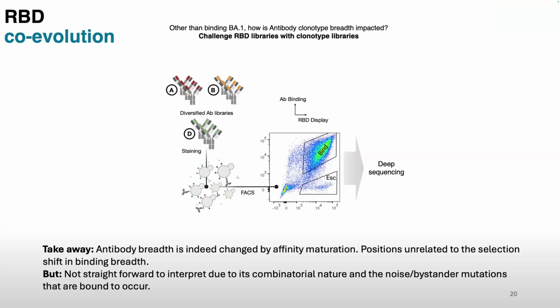It could be, of course, that you stain within such an axis that the nuance is a bit less defined, or that you might effectively have something that would maybe be slightly escaped, but you still consider it binding. But that's the only thing you can do if you didn't mean to produce hundreds of clones and check their individual affinity.